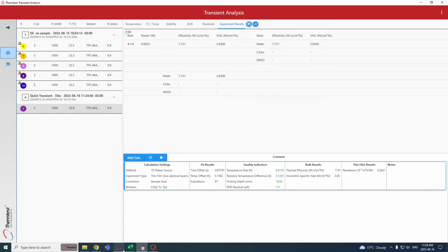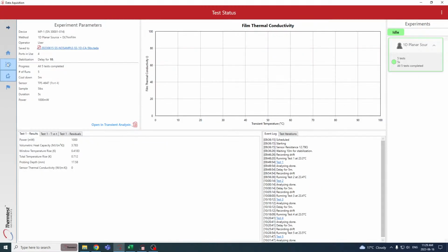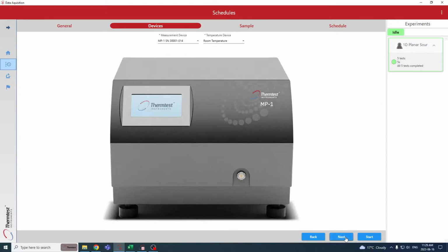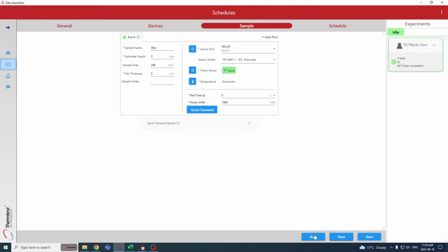So what we'll do is we'll set up an experiment with a schedule. All of these were good.